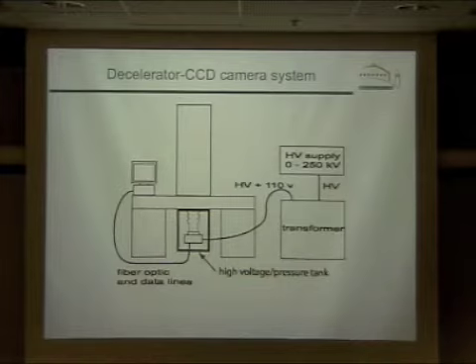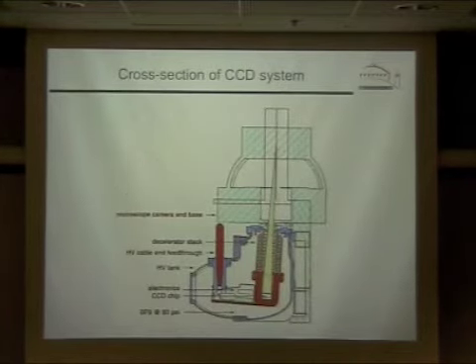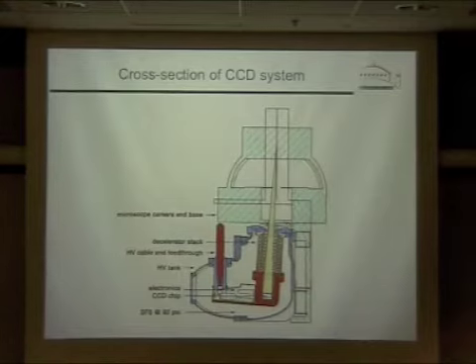I guess I've gone over my time already. But kind of in the context of dealing with some of the parameters that are important in analyzing camera performance. Here we can actually vary the performance all over the map. So this is a more clear diagram of how the system works, basically.